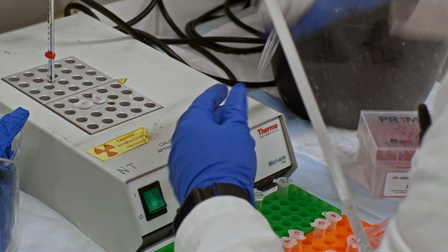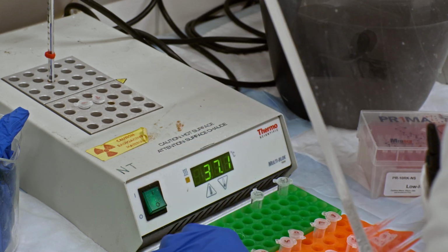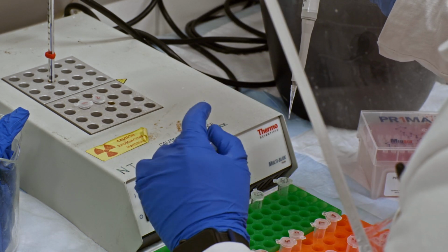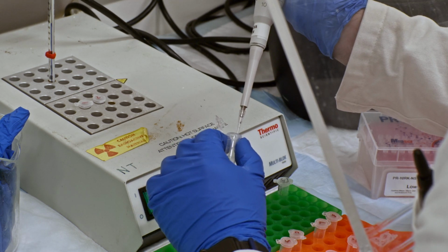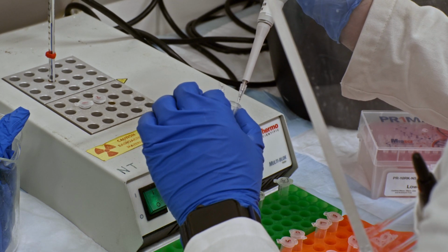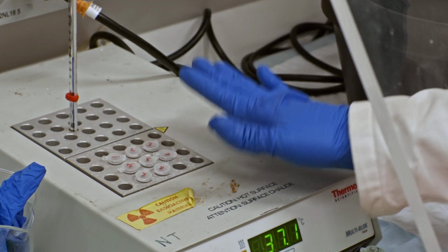Position my dNTPs right above, and we're at 1 minute. Mix them, put them on the heat block. And then this is what I'll keep doing until I add dNTPs to every single reaction vessel. Now, as you can see, all reactions are on the heat block.